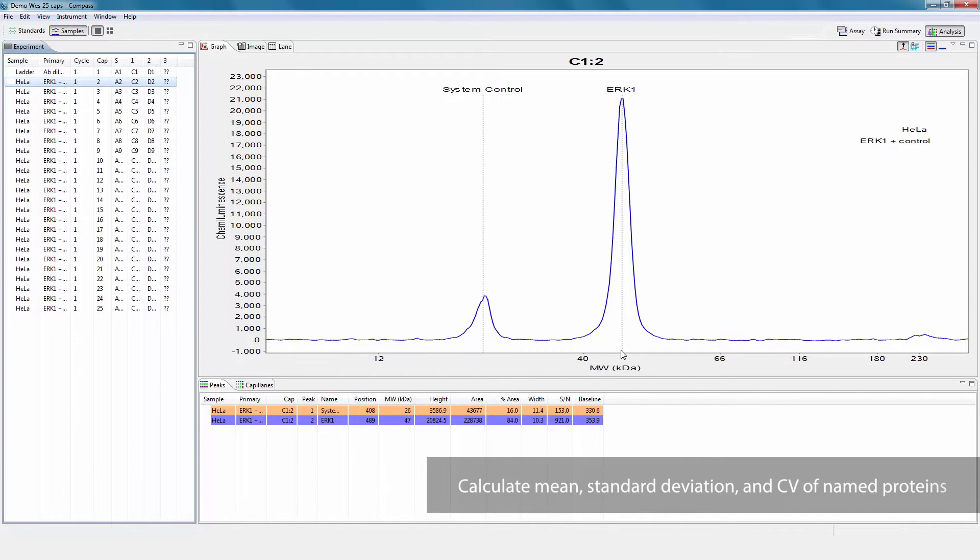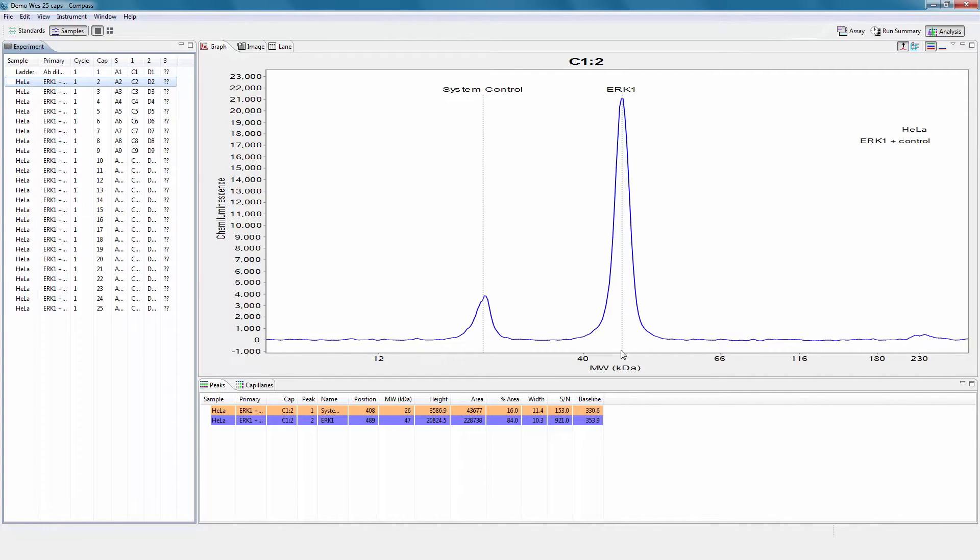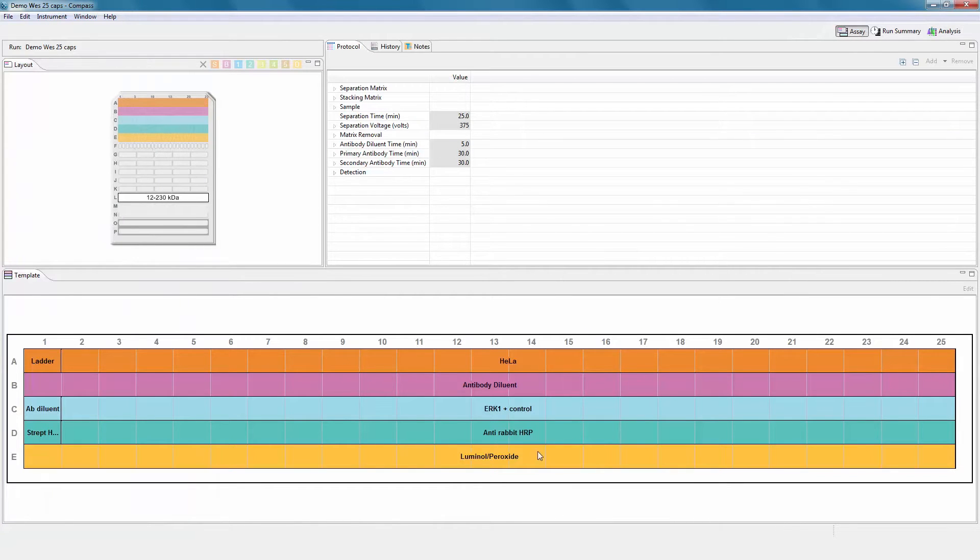The grouping view is used to analyze replicates by calculating the mean, standard deviation, and CV of named proteins. A group is automatically created for capillaries with the same sample and primary antibody name taken from the assay template.